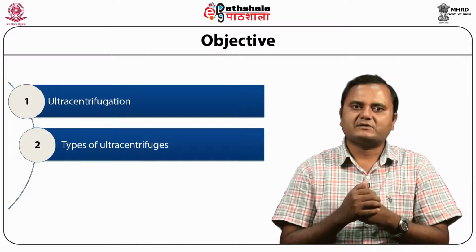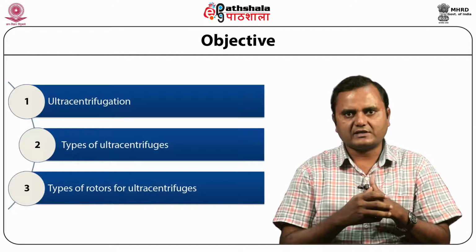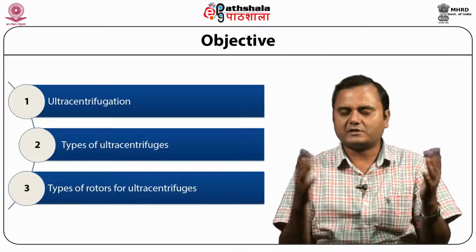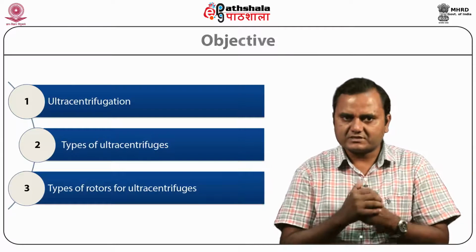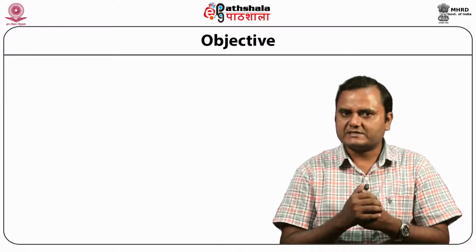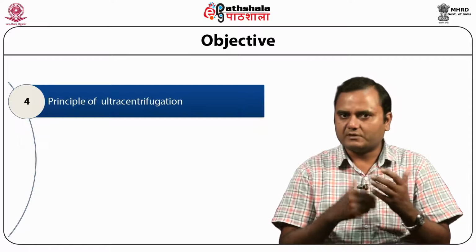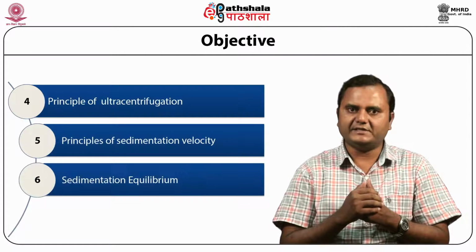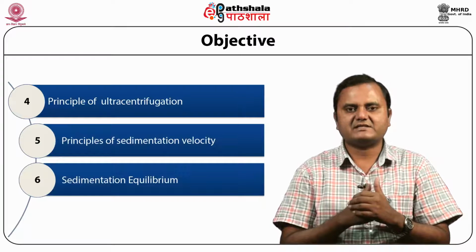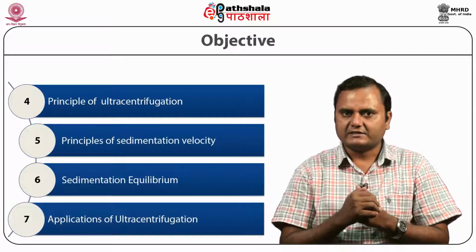Then we discuss the types of rotors for the ultracentrifuge, because the rotors used in ultracentrifugation are different from normal centrifugation and they have some advanced features, of course. Then we discuss the principle of ultracentrifugation techniques, based on the principle of sedimentation velocity and sedimentation equilibrium. And at last we discuss the application of the ultracentrifugation techniques.